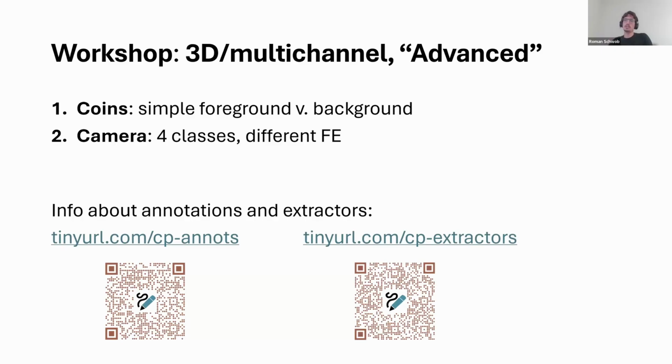Also, what I want to mention is that we're working on implementing the use of the third dimension in the feature extraction as well. Because as I explained here, right now we're treating them as stacks of 2D arrays, but obviously you could always turn around the dimensions.